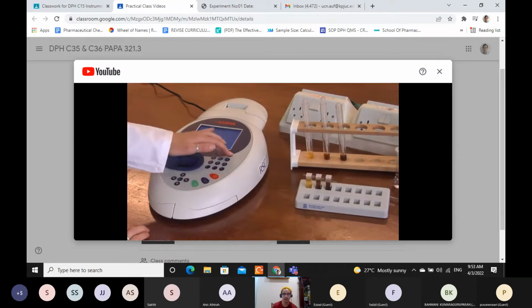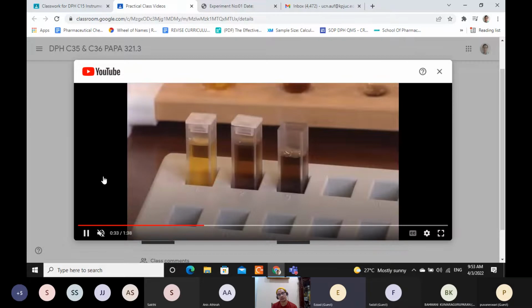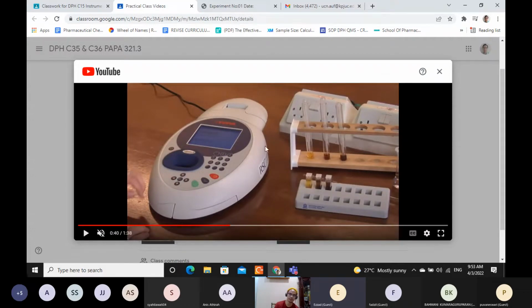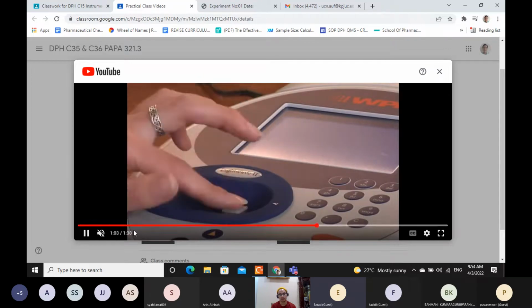So how does this thing work? I can go in detail lagi dalam chapter 6 our lecture class. Okay, but basically how does this thing work adalah dalam this machine, dalam this big bulky part here, ada satu sumber cahaya. Okay, kalau kita masukkan kita punya cuvette dalam dia punya compartment dekat dalam instrumen ni, so kita masukkan kita punya cuvette kat situ.